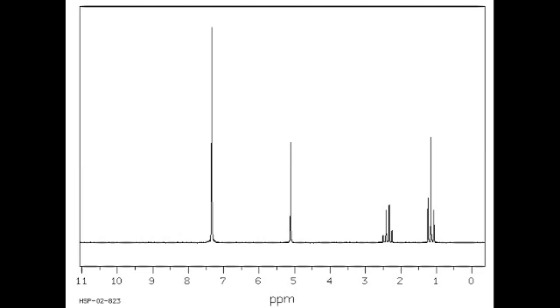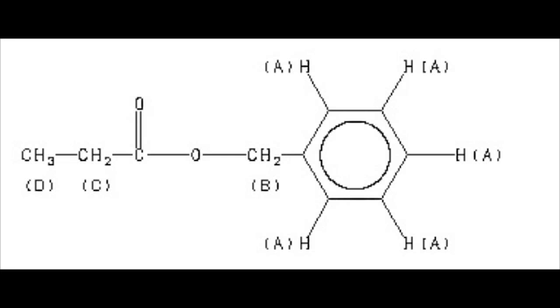And then, we have a huge tall peak at 7.4. That's classic aromatic ring action when that aromatic ring has equivalent hydrogens. All right, so here's the actual spectrum. So actually, we're right about the carbon named B. That's the one that's going to give the strong peak at 5. And we know it's that one for sure because A, it's at 5, and B, it's a singlet, and it's next to a carbon in the aromatic ring having no hydrogens and an O having no hydrogens, both of which deshield it, moving it to 5.